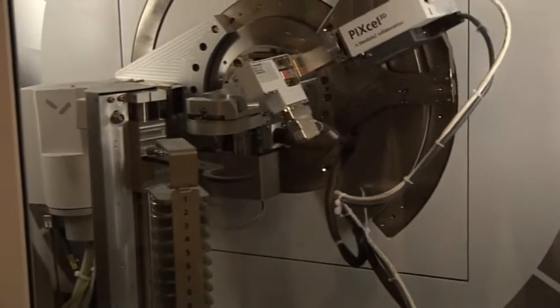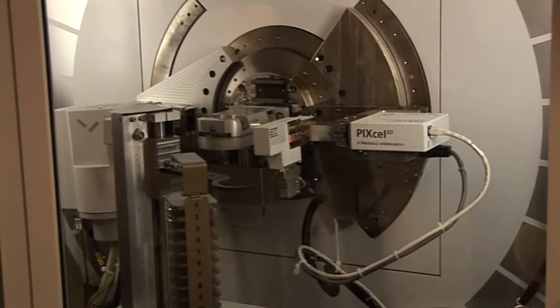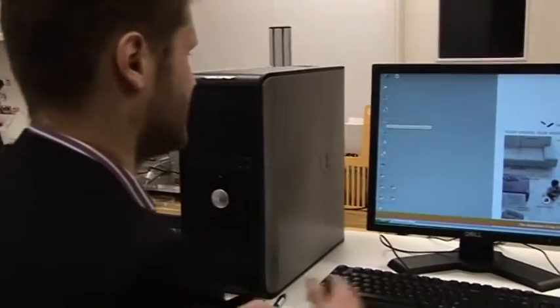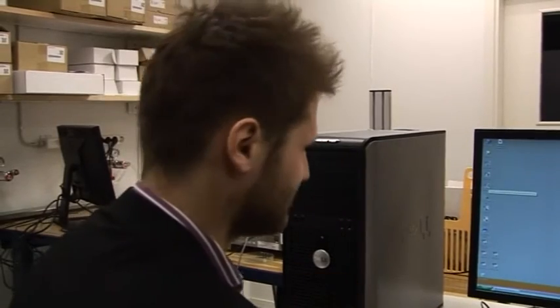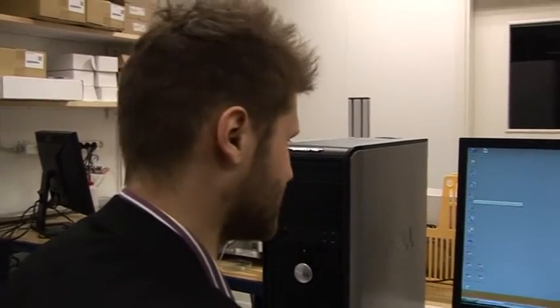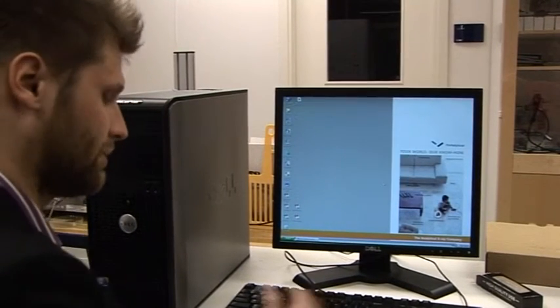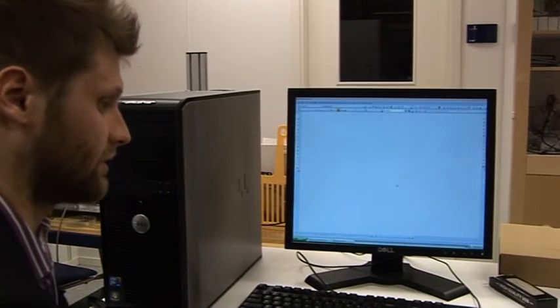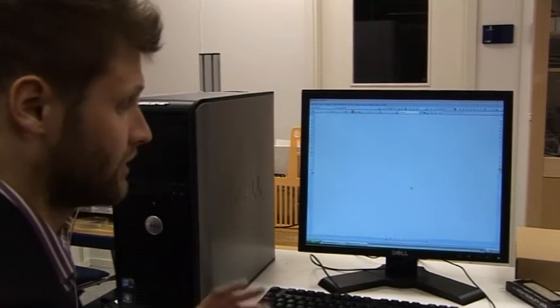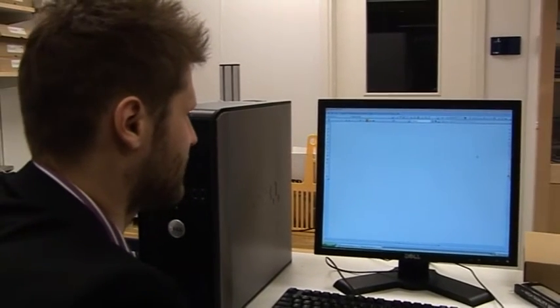You can see that it will try to pick up now the sample, put it in, go back. Then it's positioning the detector and everything. And now it's started. This was the easy part, to prepare a sample and then ask the machine to run. And then sometimes a nightmare is to evaluate the data, to get something out of the diffractograms. That is very tricky. I guess for us it will not be that difficult because the samples are quite easy. But usually people come with very complicated samples that contain a lot of different compounds and everything.